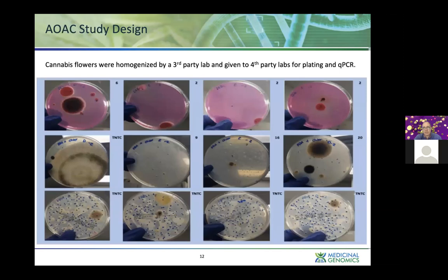So this is what some of the experiment looked like by the time it reached us. Of course, the colonies got larger than we liked for sequencing, but fortunately, the people who counted these colonies in the labs in Michigan pinpointed them with markers so we could tell where to pick. We picked those colonies and began sequencing those.